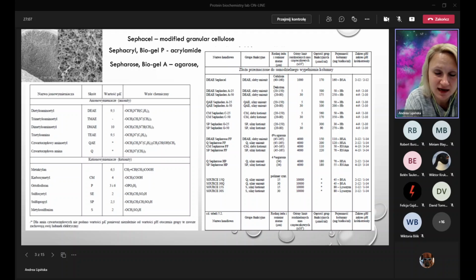Generally, some supports are more porous than others, like our Sephadex. It helps a little bit more because it also works like size exclusion chromatography. Smaller proteins go into the resin where they interact with the active groups. So they differ also by that. When you are using Sephadex, there will usually be C with a number. C is like cutoff, and the number tells you the size of the pores. It's recommended either for smaller proteins or for bigger proteins. Like C25 is for smaller proteins, the cutoffs are different. Our cutoff, I think, is from 0 to 30 kilodaltons, so it should be better for smaller proteins.